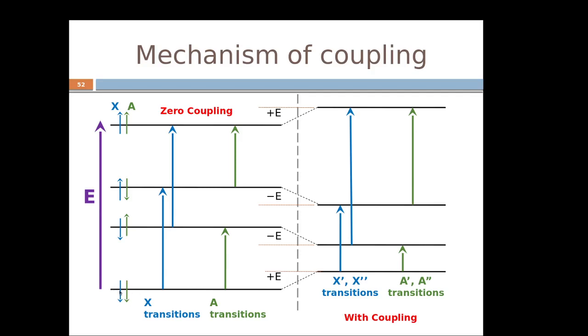That's what we show here. Whereas when the nuclear spin states of both nuclei align in the opposite direction with respect to the applied magnetic field's direction, we have the highest energy situation, which is being shown here. And the next two possible configurations are shown here with the nuclear spin of X down and A nucleus up, and then A nucleus down and X nucleus up.